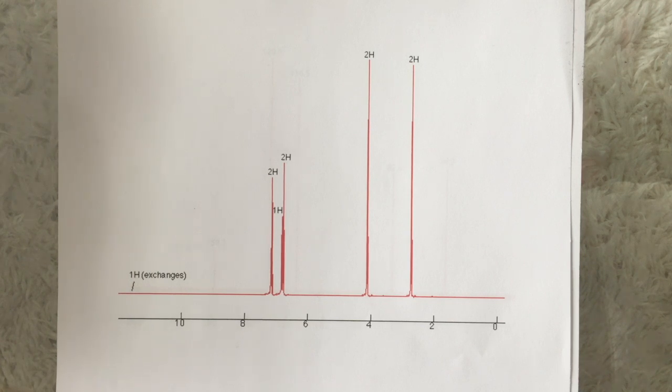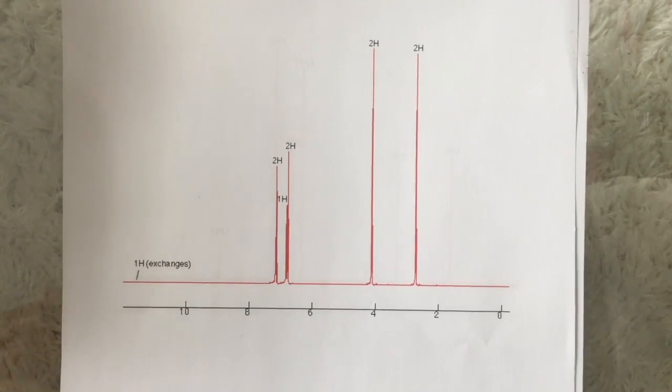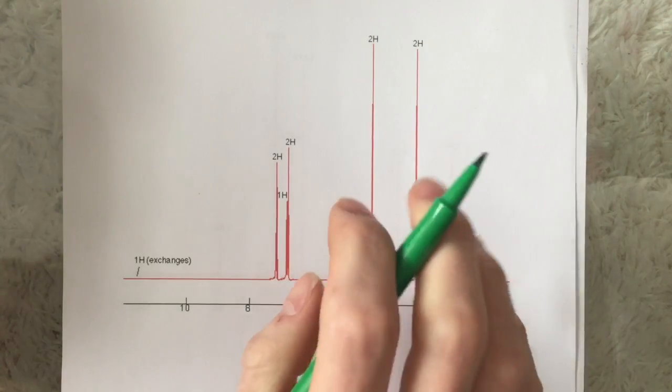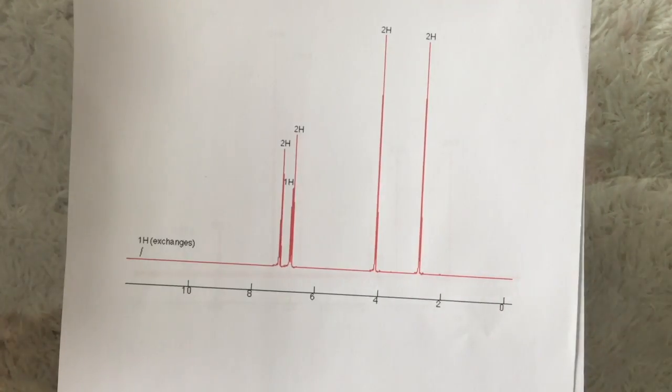And since we know that the structure could potentially have carboxylic acids, CH bonds, carbonyl groups, C double bond O, and we also know it's C9H10O3, we're able to construct a structure which would make sense of the different splitting from the proton NMR.